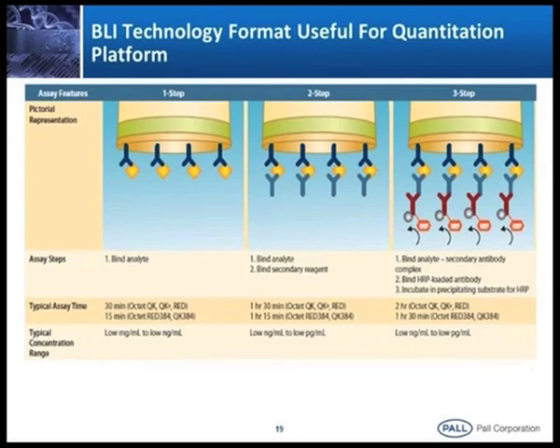Whatever I had shown is called a direct binding, 1:1. This is your antibody or antigen or a protein. Here we can work from low mg per ml to low nanogram per ml. The instrument dynamic range is 50 nanogram per ml to 2 mg per ml. This is what we call a direct binding.